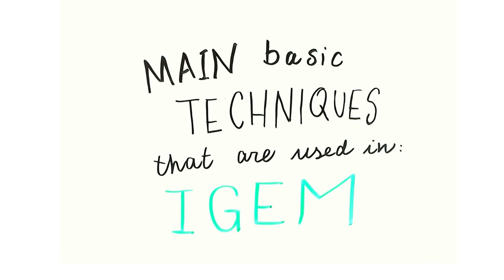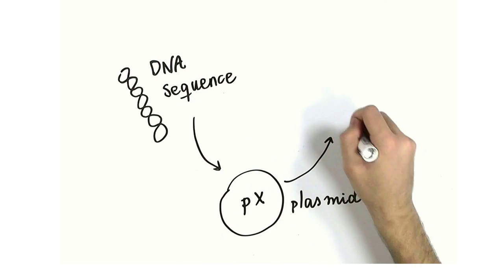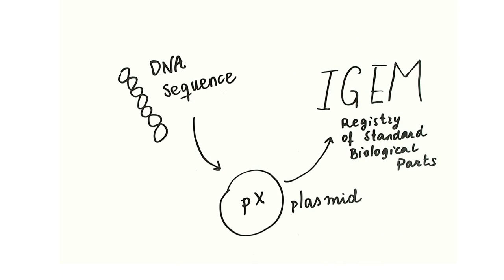In this video, you will get a brief outline of how you can go from a DNA sequence design to an actual plasmid that you can transform for your iGEM project. This includes going through some major molecular biology laboratory techniques.